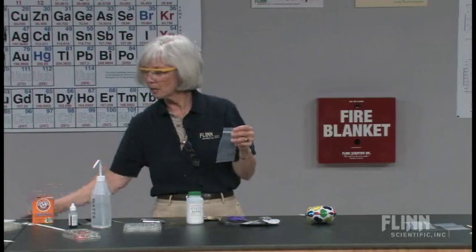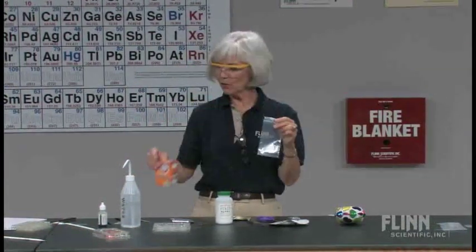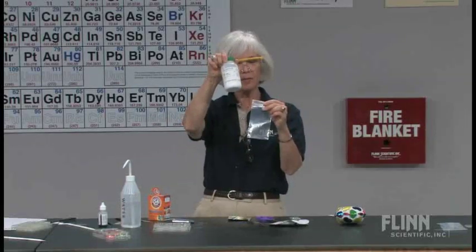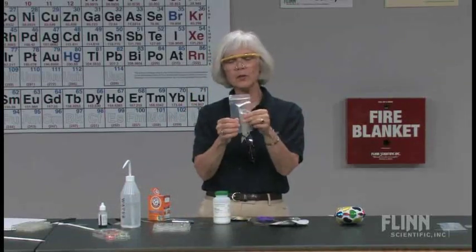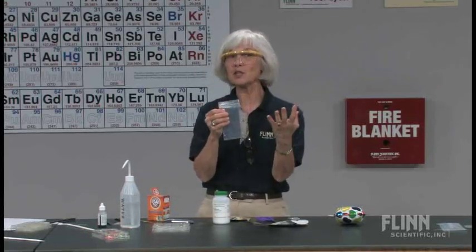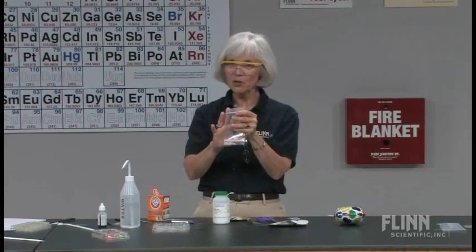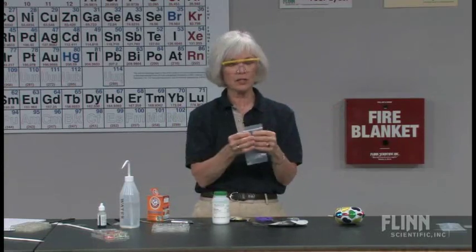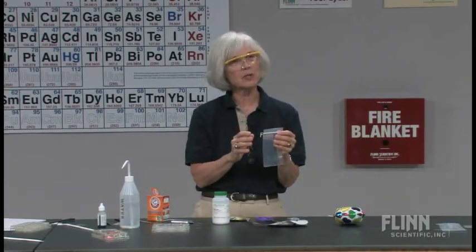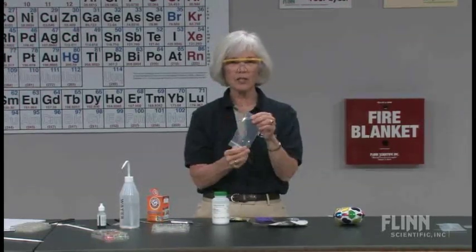You're going to take baking soda and you're going to take citric acid and you're going to react them to fill this bag so it would be like a balloon and to fill it so that it doesn't explode but that it does fill it. So what are they going to have to do? They're going to have to measure the volume of the bag. And then they're going to have to determine, again, at the conditions of the room, what would be the stoichiometry to get this bag to fill up with carbon dioxide without exploding it.